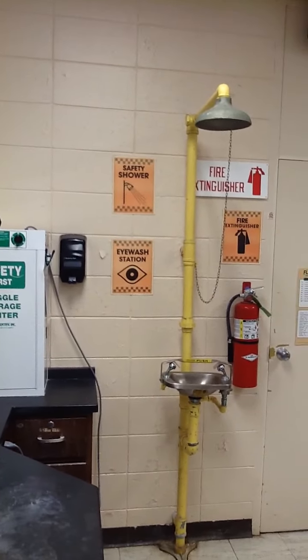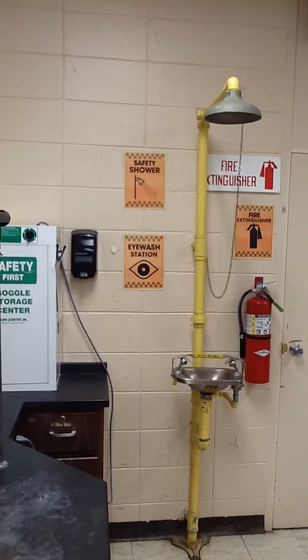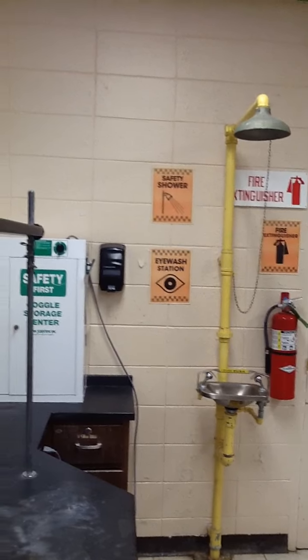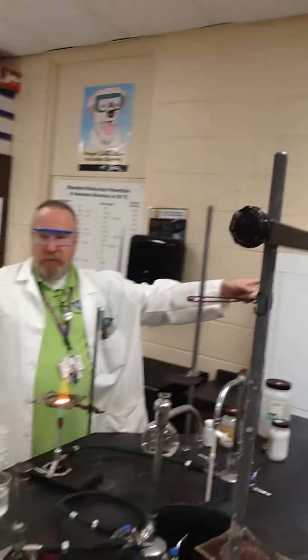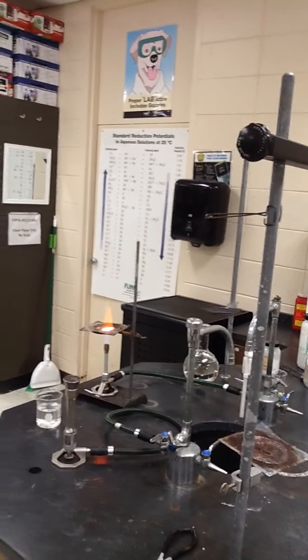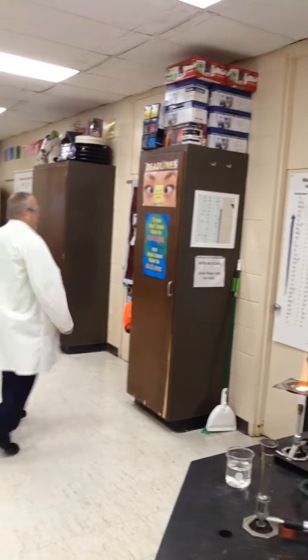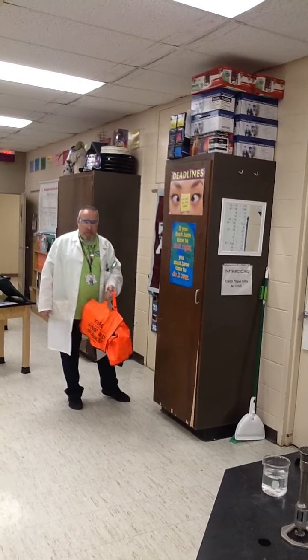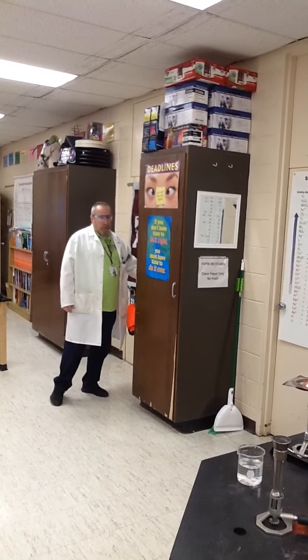Anytime I'm working with flame, once again safety, I know where my emergency shower is, although I prefer it be used for chemical spills and not for putting out fires. I would hate for someone to run to it and fan the flames, and I know where my safety fire blankets are in the lab and how to access them before I do anything with fire.